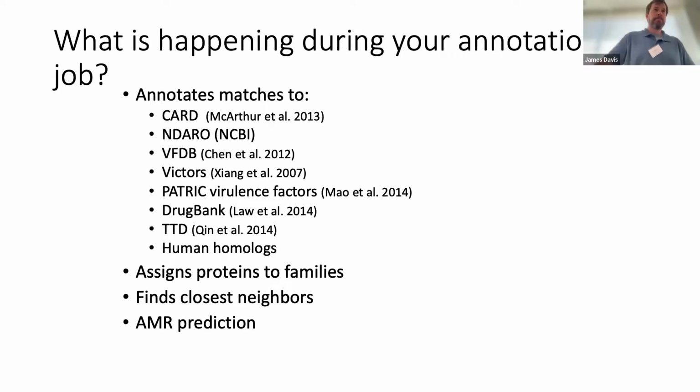Yeah. Okay. There are obviously pros and cons of that, right? If you had something that was nearly clonal and that you had been curating, you'd want to inherit those. But if you have something from the environment or something that you've isolated, this is probably the better approach. And if that gene is particularly specific to that organism, then it's difficult to find de novo, right? Not if it's been annotated. If it's been annotated, we'll find it. If it's not been annotated, it'll come up as a hypothetical or something like that. Hypothetical with a potential assigned function, right? No, we haven't been doing that. Usually when we give you a hypothetical, it just says hypothetical protein.